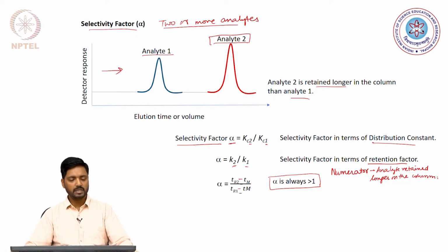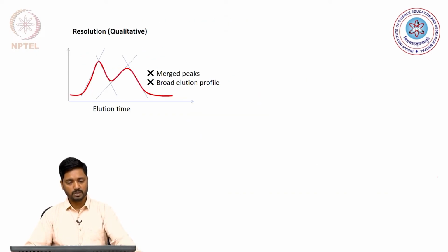So far we have got introduced to the concepts of distribution constant, selectivity factor and the retention factor. Now, let us move to the concept of resolution. Resolution is a very important concept in chromatography, and I will first describe to you resolution in a qualitative manner, and then we will see how we can quantitate this resolution from the chromatographic profile or chromatogram that we have generated for our analytes.